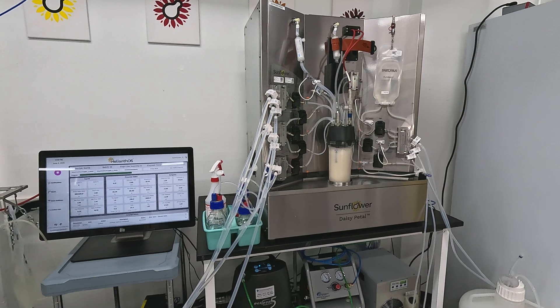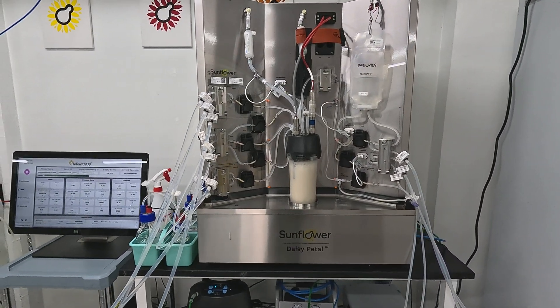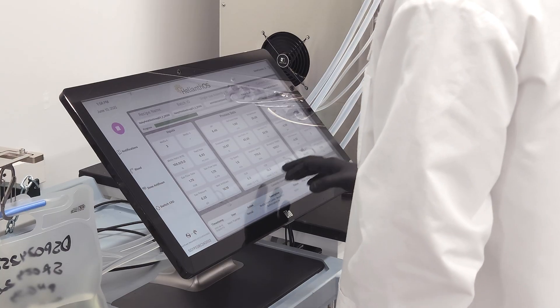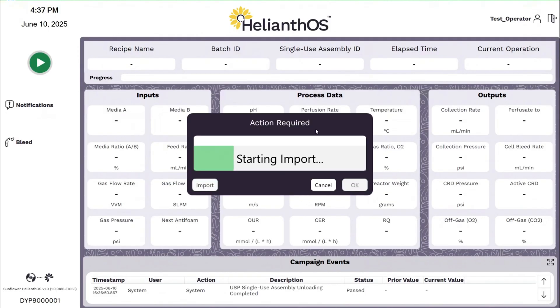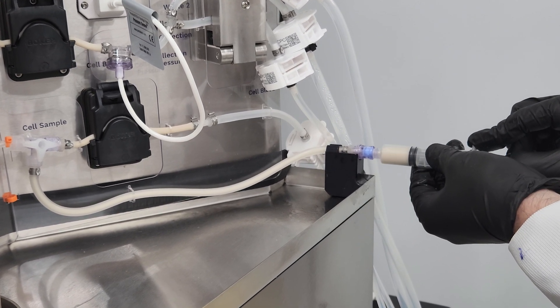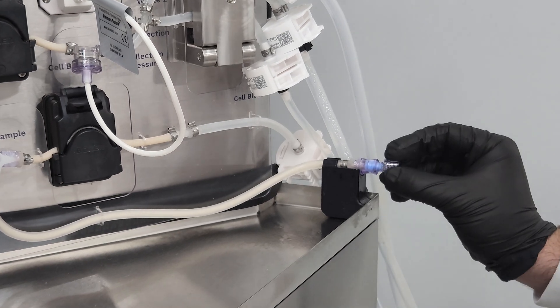In this introductory video series, we're going to walk you through the capabilities and advantages of the Daisy Petal System. We'll demonstrate the installation of a single-use assembly, provide an overview of the system software, load and execute a process recipe on the petal workstation, demonstrate cell sampling and perfuse a collection during a fermentation run, and then observe the automated system shutdown process at the end of the campaign.